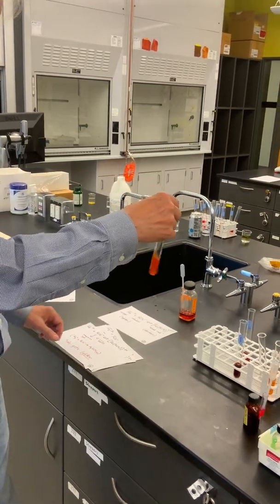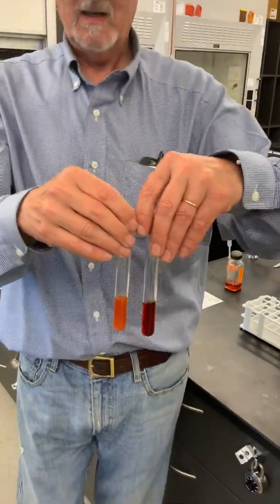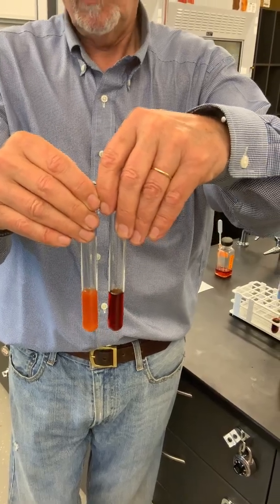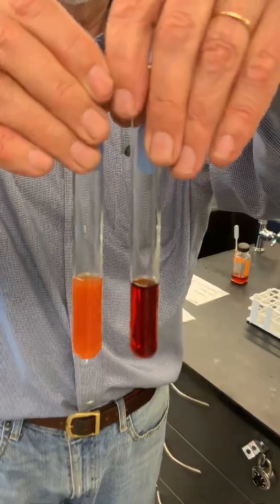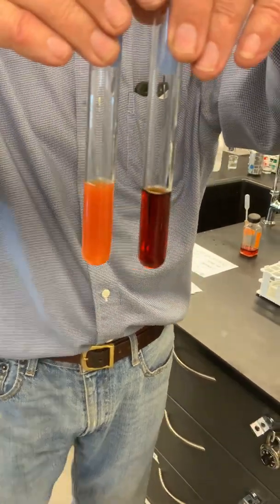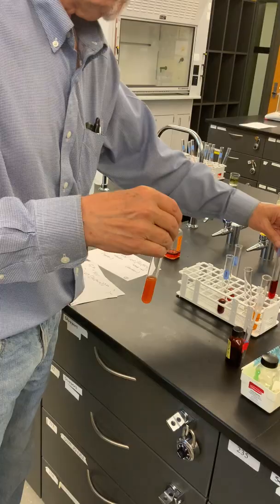Here then our original. Here our test solution. Two things have happened. One is the solution has definitely gotten lighter. And also, if you look very, very carefully, you can see the cloudiness. That's the result of the precipitation of some solid silver thiocyanate.